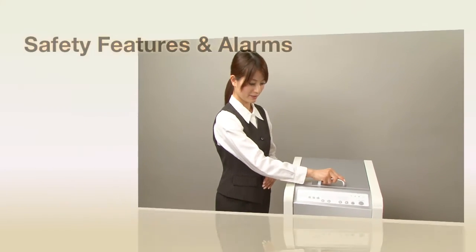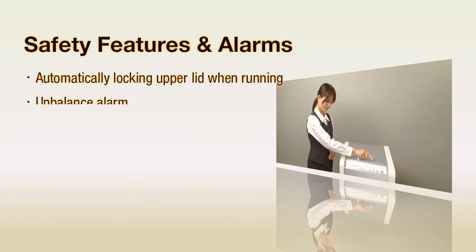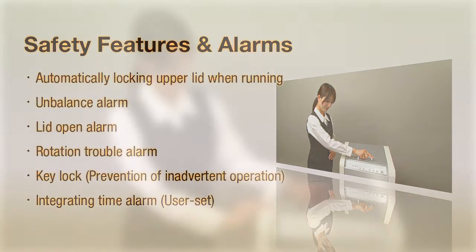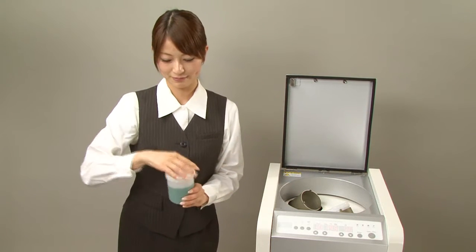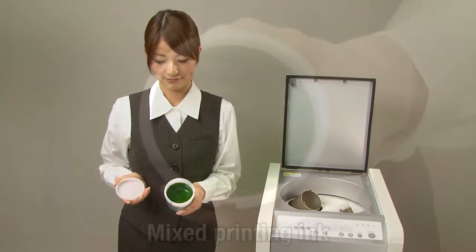Sound safety features, including an automatic upper lid locking mechanism, ensure users a high level of safety in use. Reliable operation is a promise. See for yourself — in just a short amount of time, the highly viscous material has been thoroughly mixed.